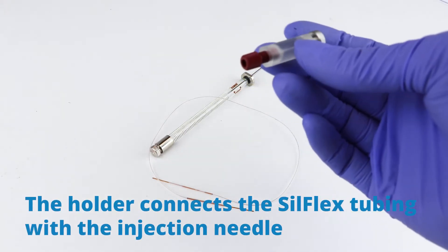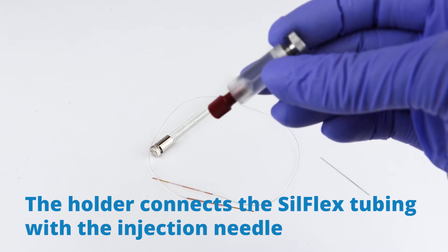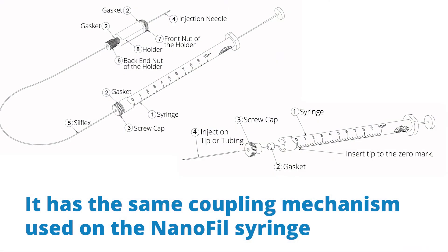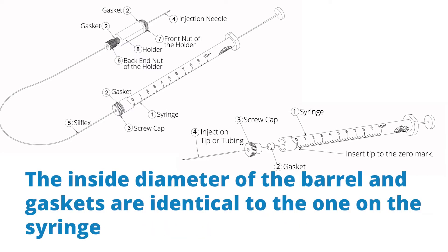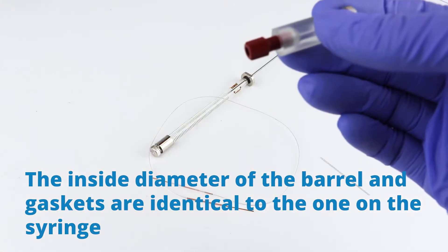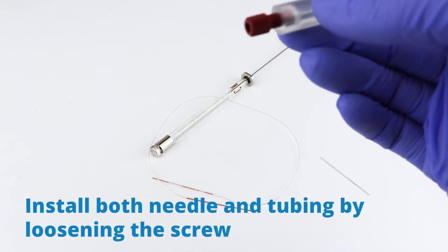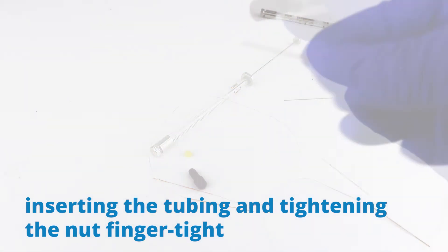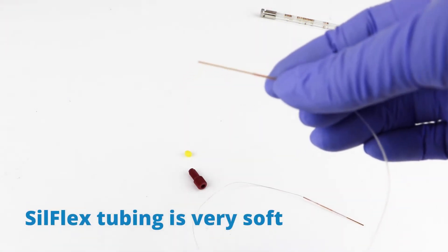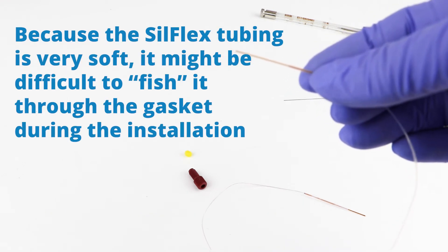This holder connects the Silflex tubing with the injection needle. It has the same coupling mechanism used in the Nanofill syringe. The inside diameter of the barrel and the gaskets are identical to the one in the syringe. You install both the needle and the tubing by loosening the screw, inserting the tubing, and tightening the nut just finger tight.